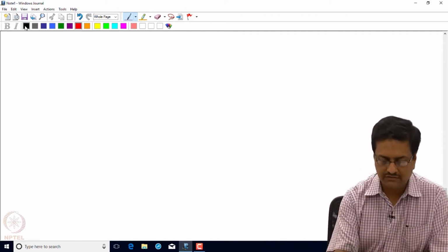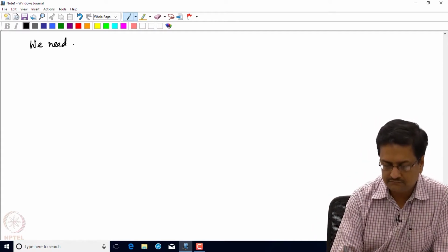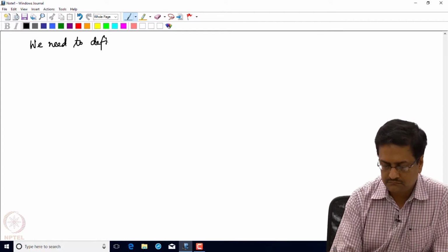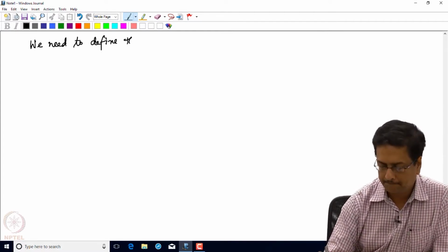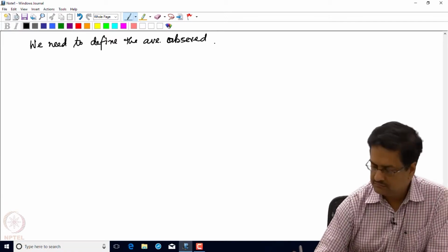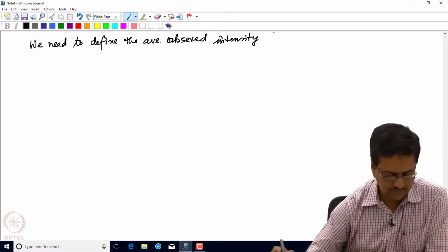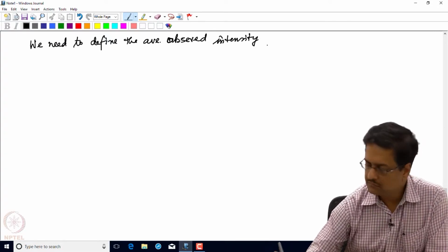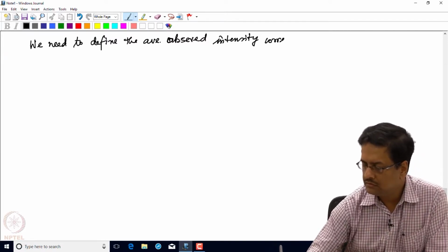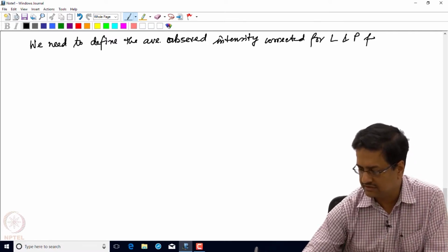Now we need to define the average observed intensity corrected for Lorentz and polarization factors.